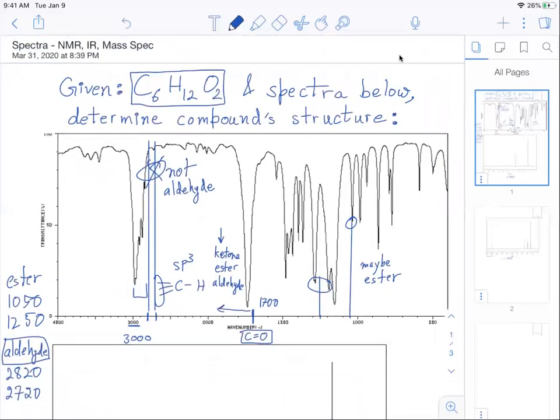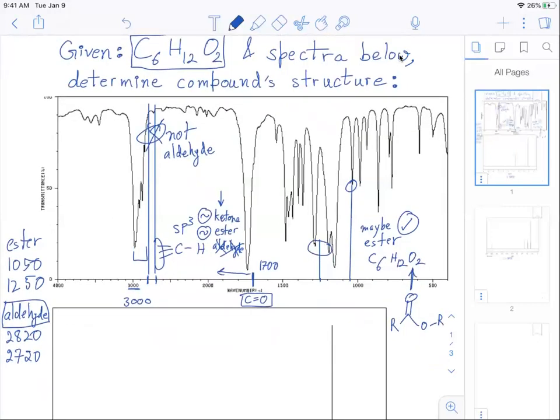Now this is where you stop and you don't try to get any more information out of your IR because they're generally very terrible. So all you look at is wait a second there is C6H12O2, two oxygens, and esters usually have two oxygens in their template. So let's just bank on the maybe ester and if the match doesn't work out we'll turn around and try to look at it as a ketone. So it's maybe a ketone and it's maybe an ester but it's definitely not an aldehyde. That's what the first graph helps us figure out. Nothing more.